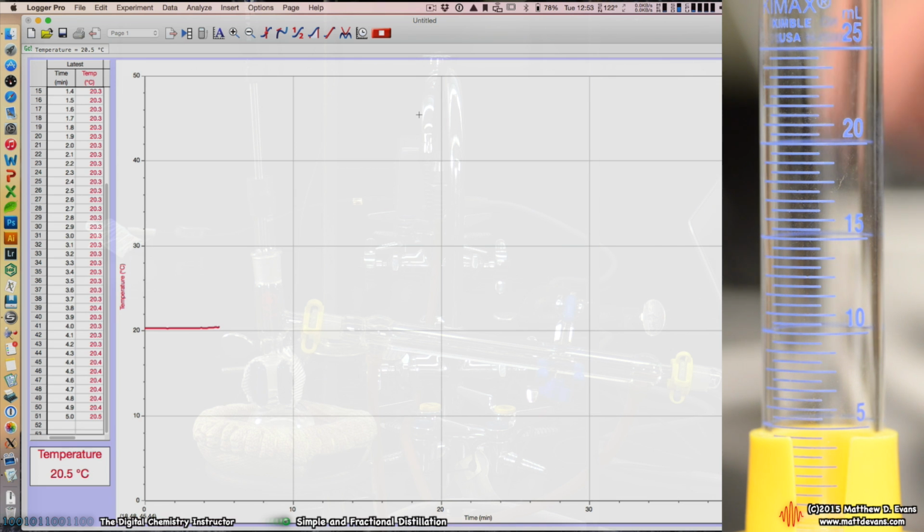Right now I'm scaling the temperature back a little bit. I'm turning the dial down to approximately 3. I gotta really keep an eye on the drip rate in this experiment. I don't want it to go too quickly. If you go too quickly, it wrecks the separation part of it, and that's the most important thing in distillation. We're trying to separate the two compounds. If you rush this, it's gonna be a disaster.